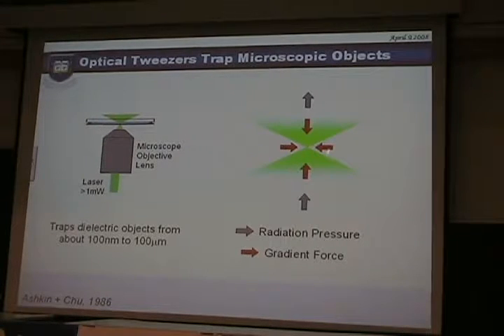If you look at the focus of this laser beam, the light is very bright. It's about, I can't remember if it's 1 million or 1 billion times brighter than the flux from the sun on the surface of the Earth, but in any event, it's awfully bright. There are basically two types of forces that matter in this very intense radiation. One of them helps and one of them hurts, and we're going to be optimistic today. I'm not going to tell you much about the thing that hurts. The thing that hurts is radiation pressure.